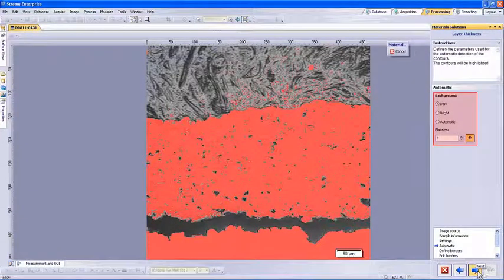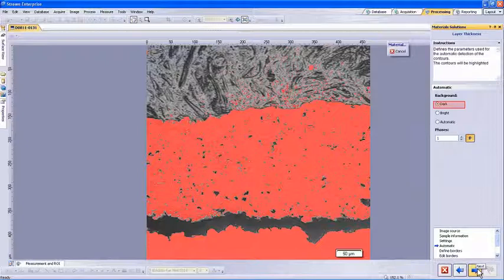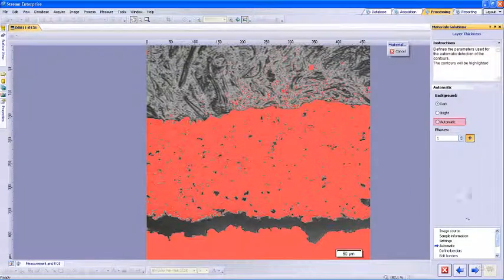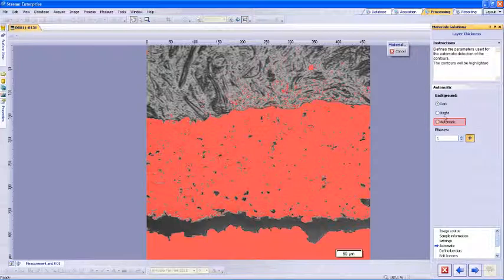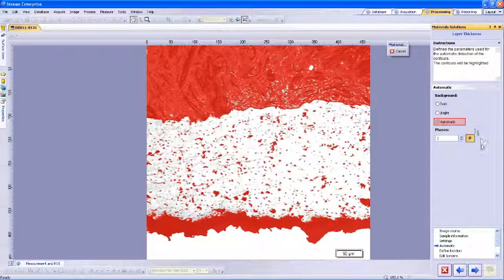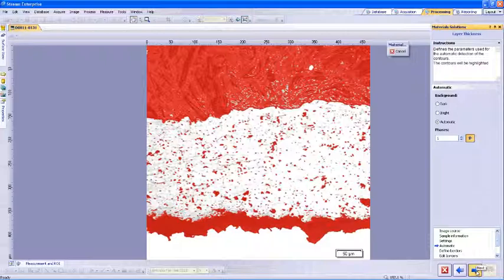At the top of this window, several options with which we can specify details concerning the background can be found. Select the dark option if the image displays a dark layer in front of a bright background. Select the bright option if the image displays a bright layer in front of a dark background. Or we can let the software automatically determine the setting. For this image, select automatic to allow the software to set the background selection. After setting the background selection, click on the next arrow to move to define borders.